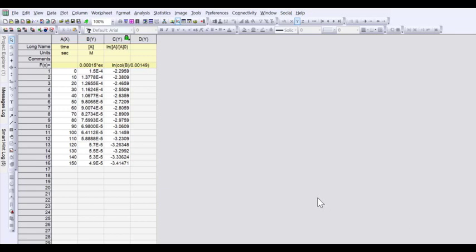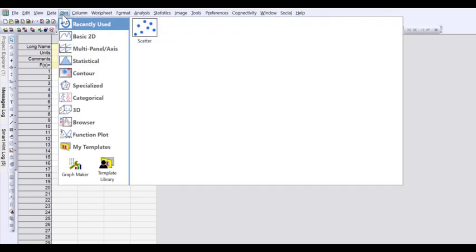All right, so in this video we have some data, some x, y data, and I want to draw a graph of this data.